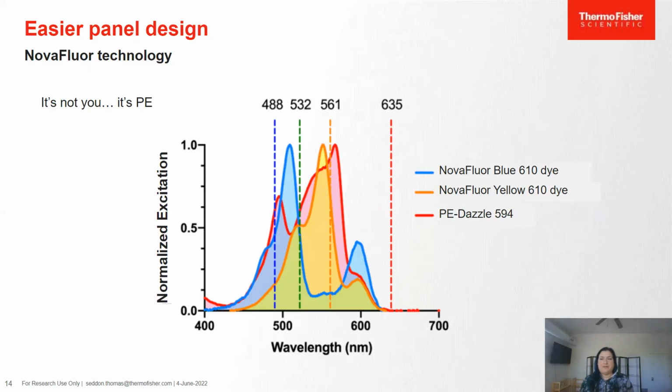And of course, this depends on having the filters. So a number of folks that have built cytometers before this have built around this problem, and that's why you tend to see fewer detectors off the blue laser, but that's not necessarily required.